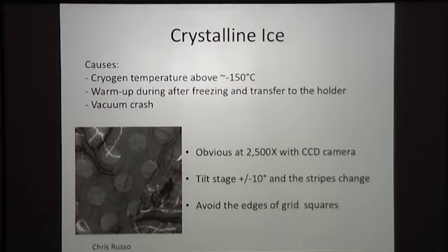If you crash the vacuum in the microscopes, rarely, but sometimes, the holder temperature at the tip, because it's not cooled directly, it's cooled indirectly, will warm up. So these are some of the causes. And like I said, avoid the edges of the grid squares.